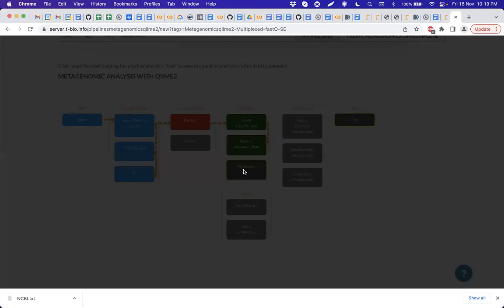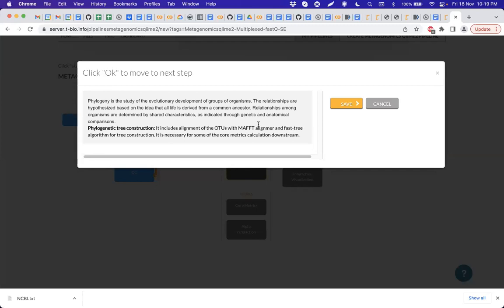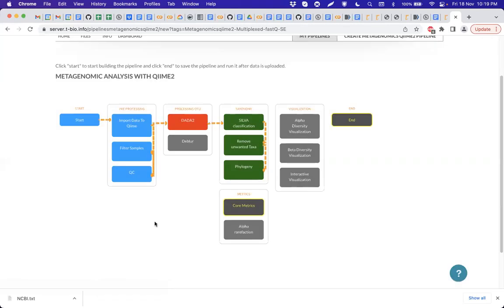And again, as I mentioned, phylogeny is a method with which QIIME creates lots of this. No, QIIME will take care of that. Low quality sequences, QIIME will actually take care of that. Most of the time, you will not experience trimming sequences at X base pairs. Why?